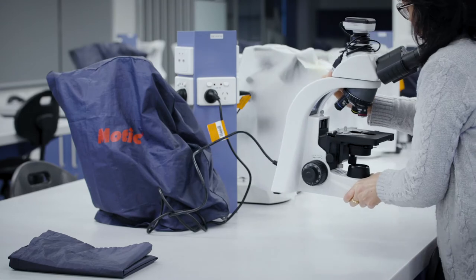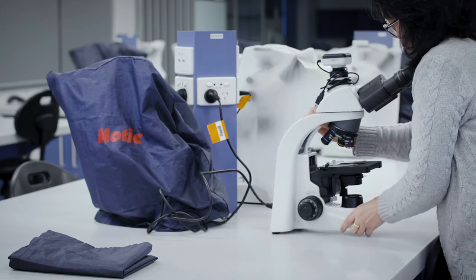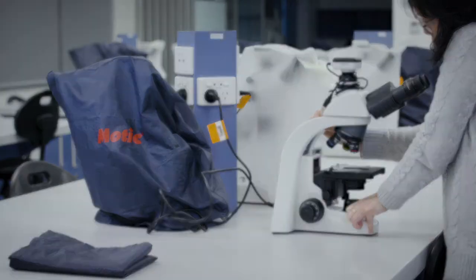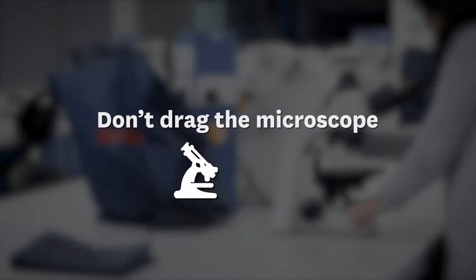Move and place the microscope in front of you towards the edge of the bench. Don't drag the microscope because vibration will loosen the lenses and damage their alignment.